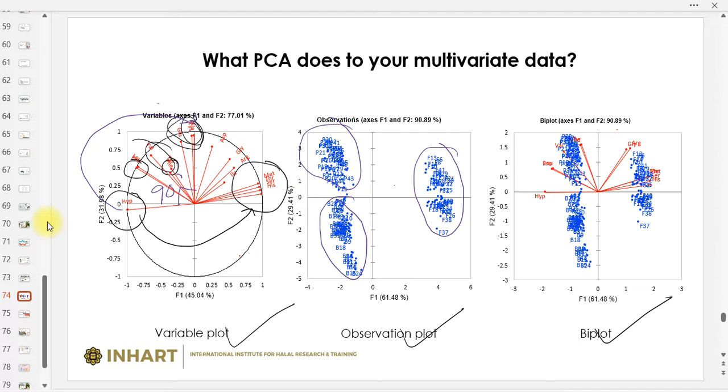That's why fish is located on the right side. Porcine and bovine have a near correlation. That's why they are located together. The first reason is that porcine and bovine are mammalian. Fish is not mammalian, definitely. Another one, there is also an indication that some amino acids in porcine and bovine have similar profiling. But with a good analysis technique, you are still able to differentiate the grouping, in this case.